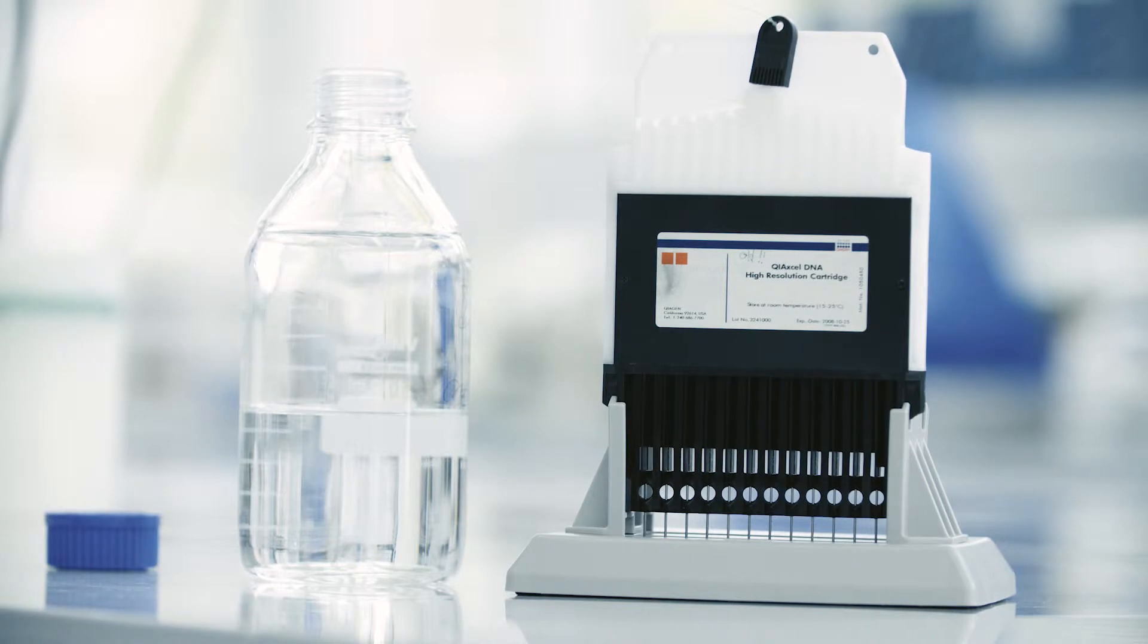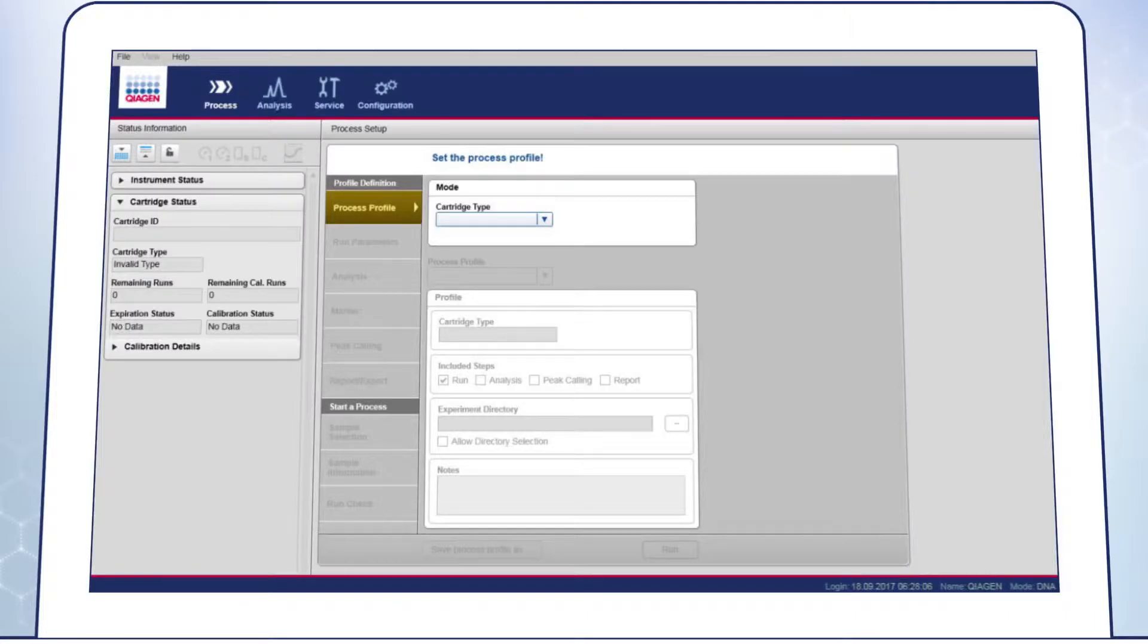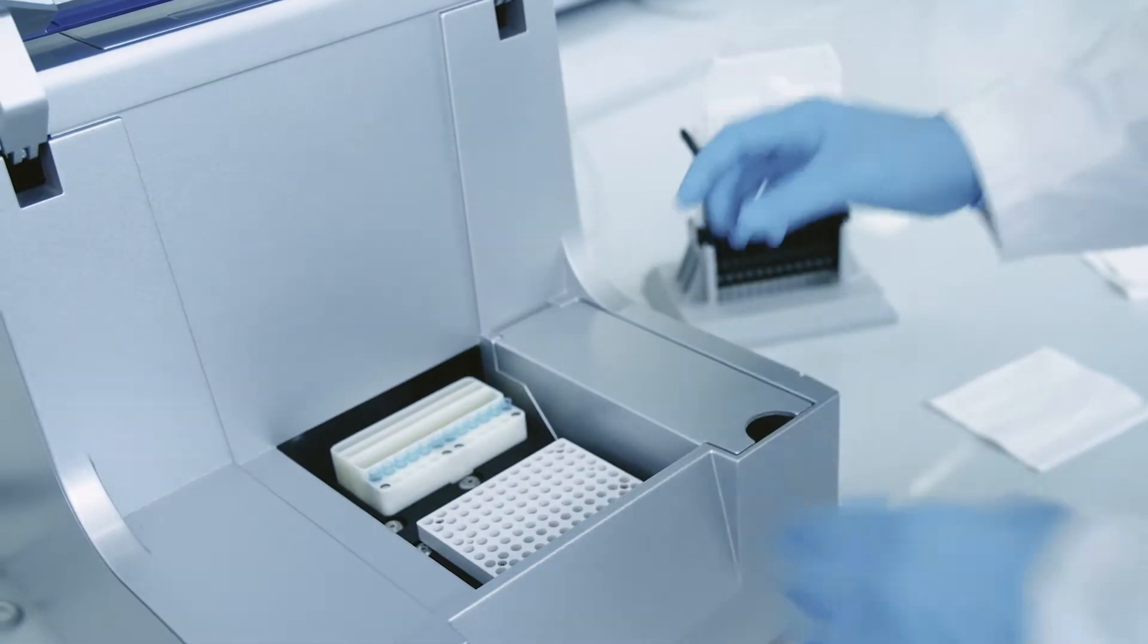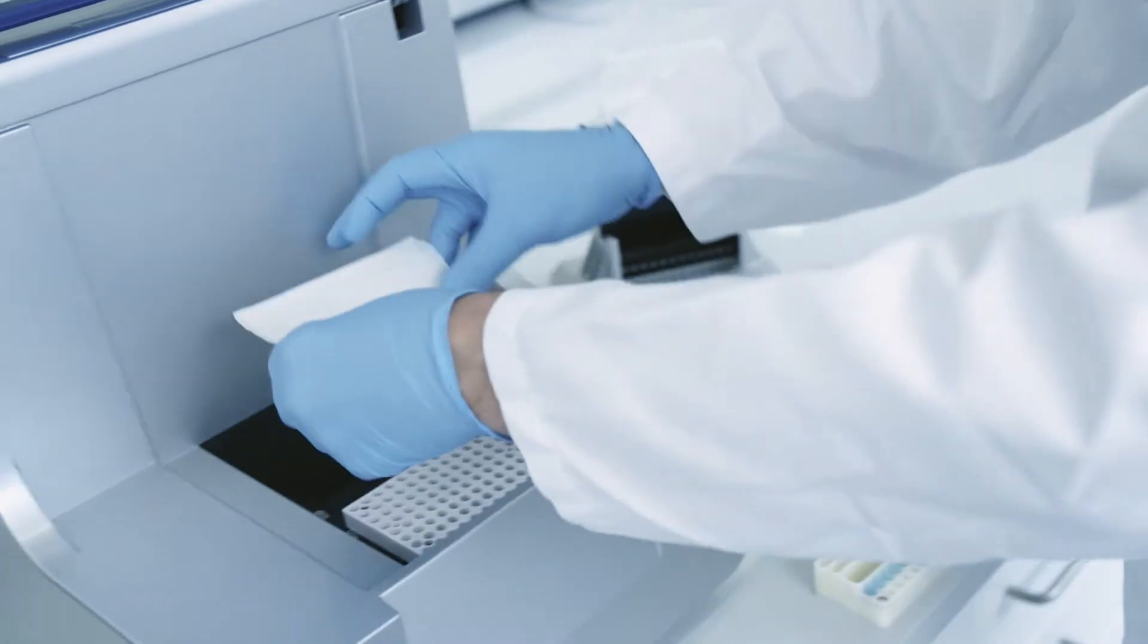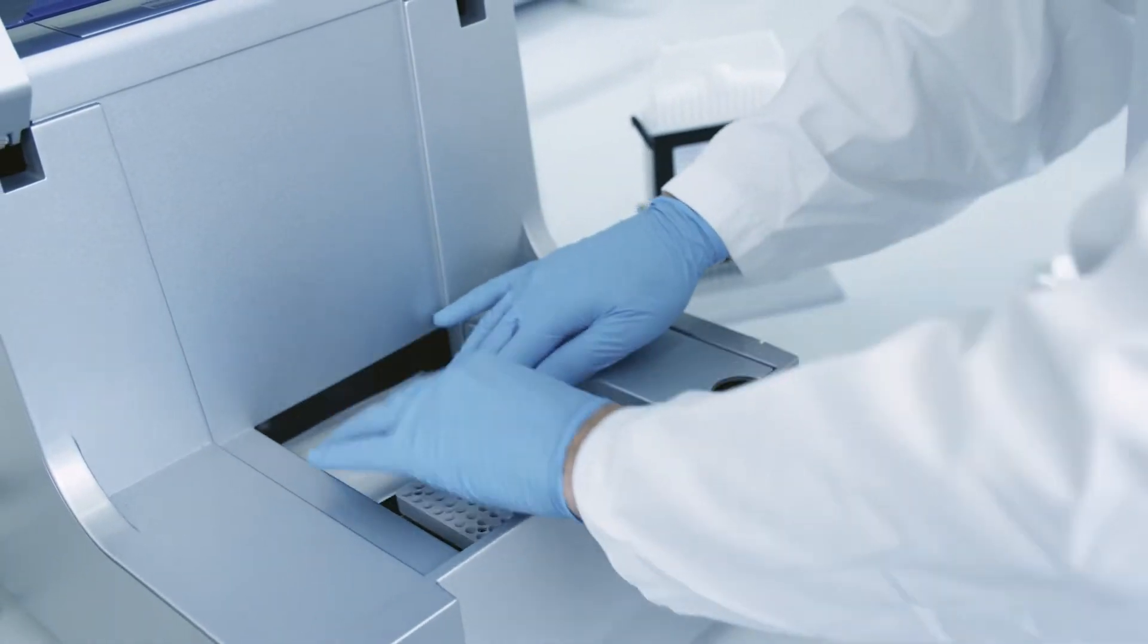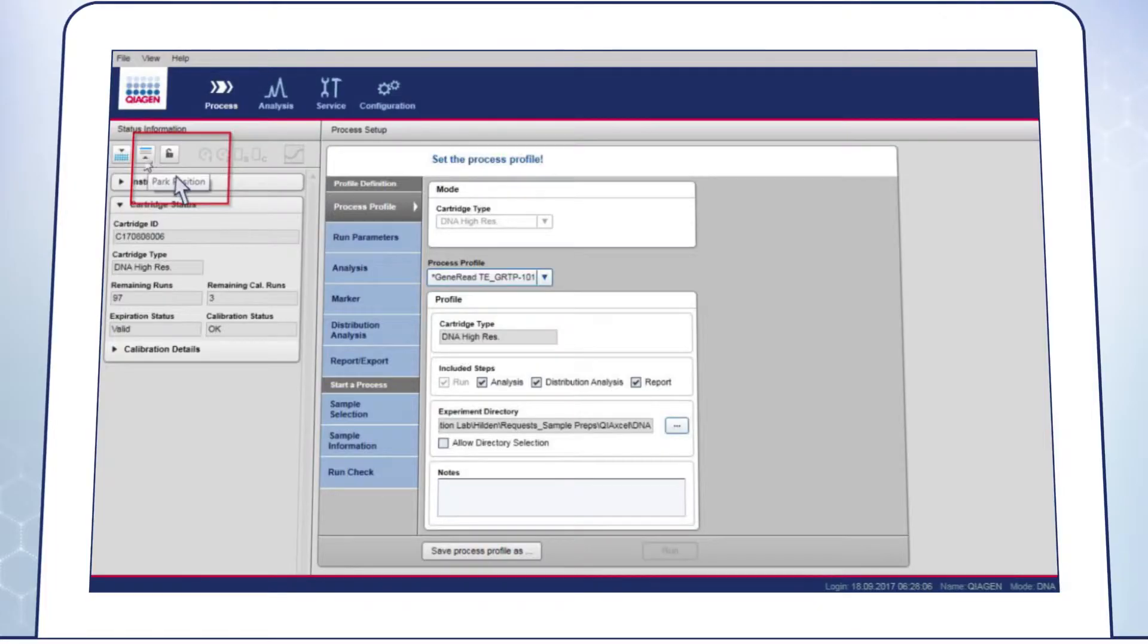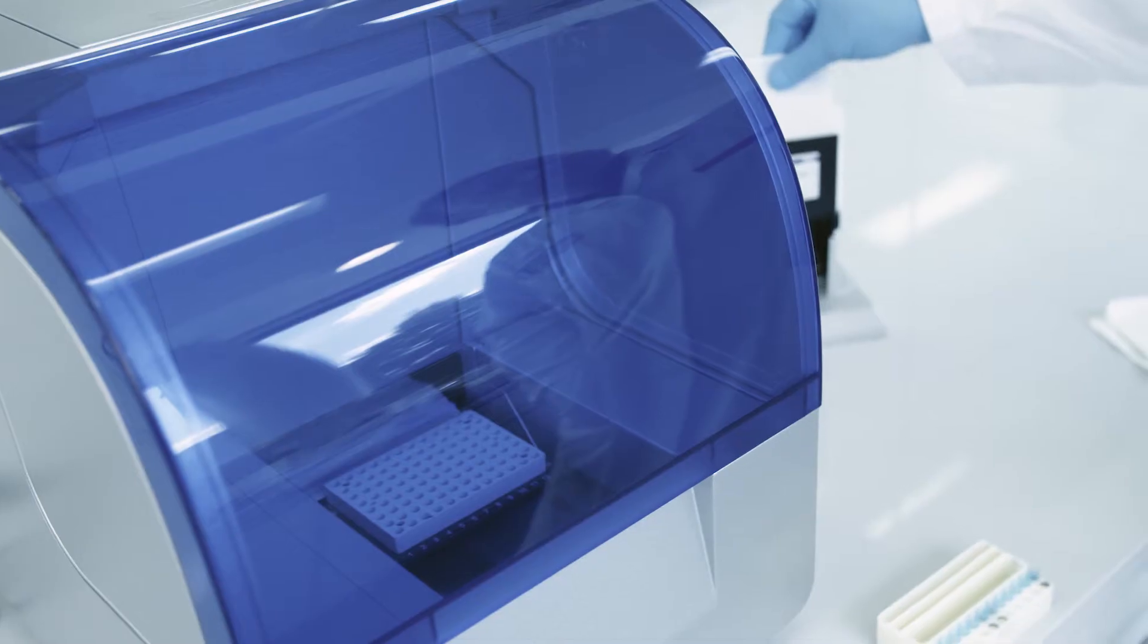This should soften the gel in the capillaries. Launch the QIAxcel ScreenGel software and click Load Position. Then remove the buffer tray from the buffer tray holder, place a soft tissue on the holder and click on Park Position.